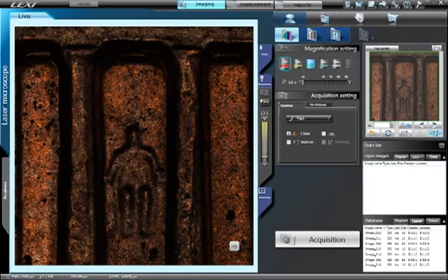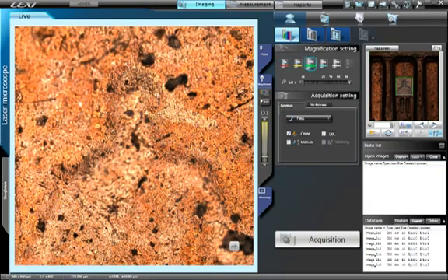In this example, we want to acquire a 3D confocal image of Abraham Lincoln on the back of a US penny. The entire body fits within the field of view at the lowest magnification. However, the 5x objective lens does not provide the required resolution to acquire a 3D high-quality confocal image. Specifically designed for the 405 nanometer wavelength of the LEXT, the 20x objective lens provides the resolution required to acquire a high-quality 3D confocal image. However, the entire body does not fit within the field of view.